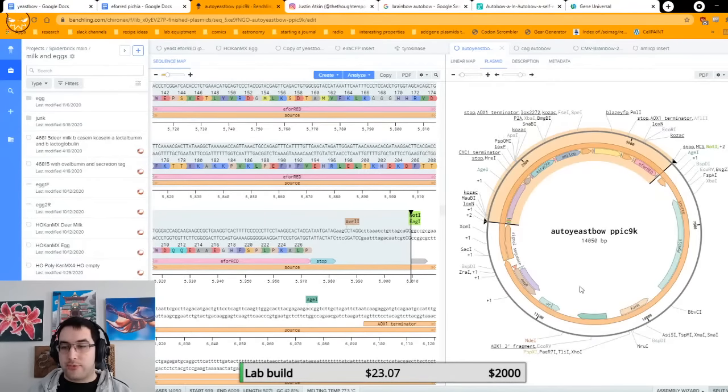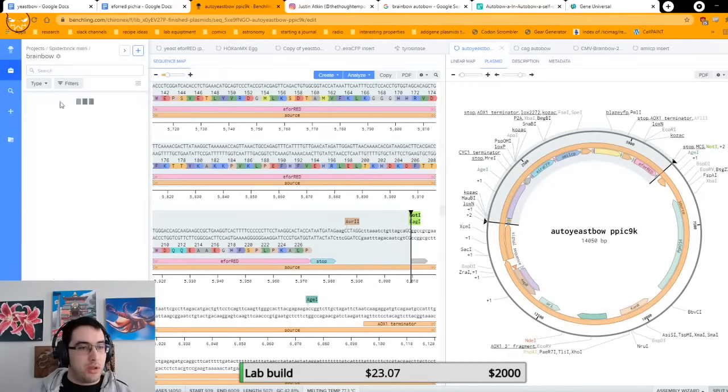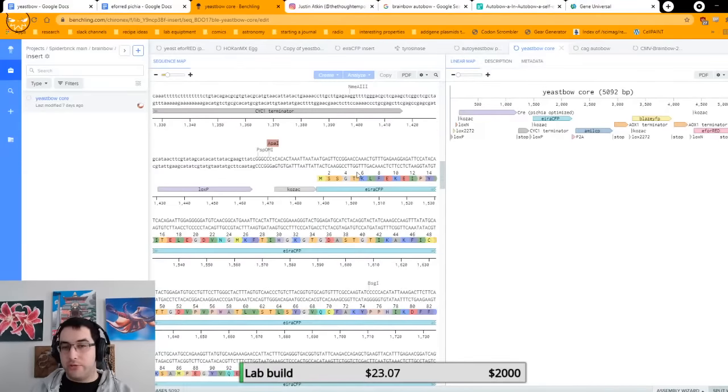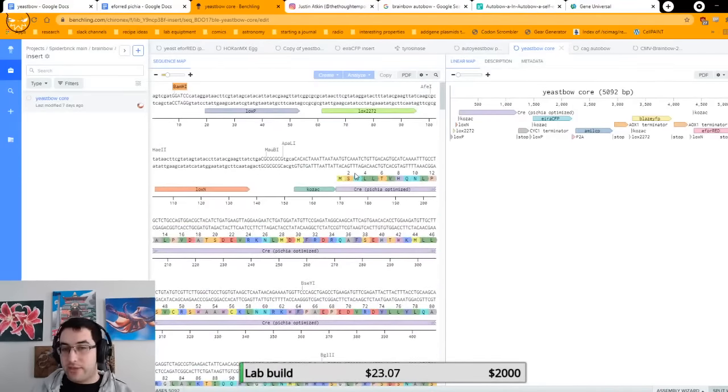So before I actually ever put a piece like this into a backbone, here I can show you. Just got to go to Brainbow. So you go to Brainbow, insert, Yeastbo core. When I'm designing DNA, I don't usually design it in the backbone. I'll keep in mind what restriction sites I need on either end, but I'll design it as a blank file like this and just build it up piece by piece. So in this case, I want them to essentially print this entire file, so that if they take this printed chunk and digest it with the right enzymes, they can shove it into the backbone that I want.